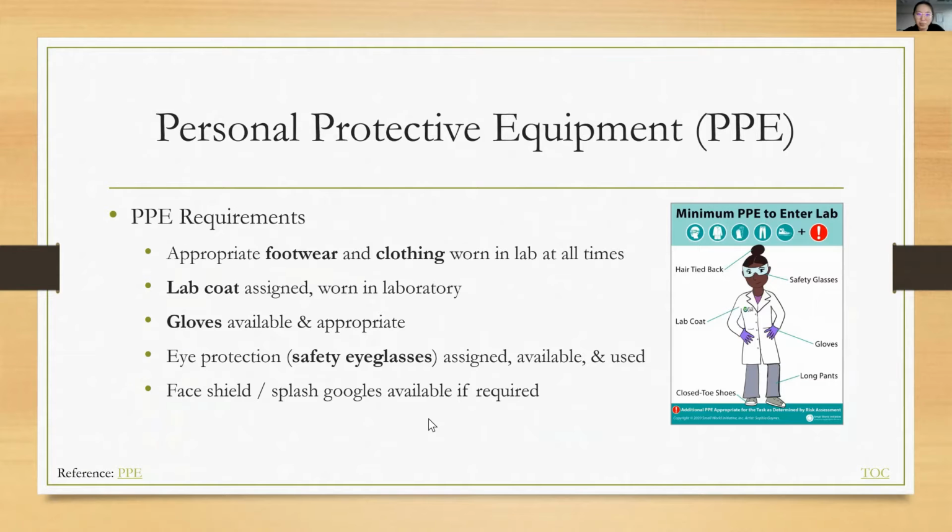So next one is about the personal protective equipment. I don't want to talk about that too much because everyone should already be very familiar with that. Lab coats, gloves, and safety glasses. Just saying that when there is an administrative audit, please make sure that you are wearing the safety glasses. I'm not making it mandatory for our daily life, but just make sure that you know what to do when there is an audit. Okay, clear?